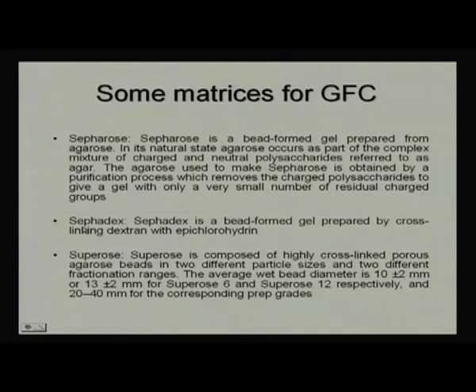Sephadex is another matrix which is also a beaded gel, cross-linked with dextran molecules by the technique of cross-linking where epichlorohydrin is used, the chemical which helps in the cross-linking process.